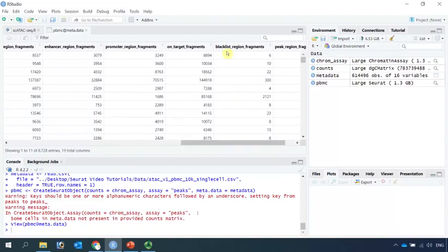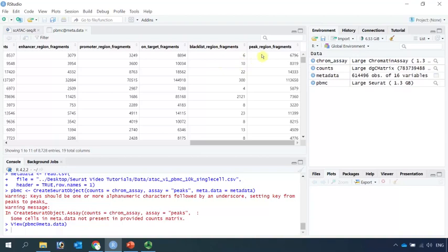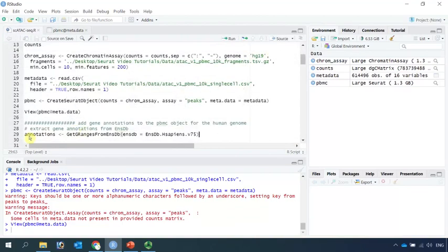We also have some information down here. For example, the blacklist region fragment, peak region fragments. This information, we need them to perform quality control analysis.